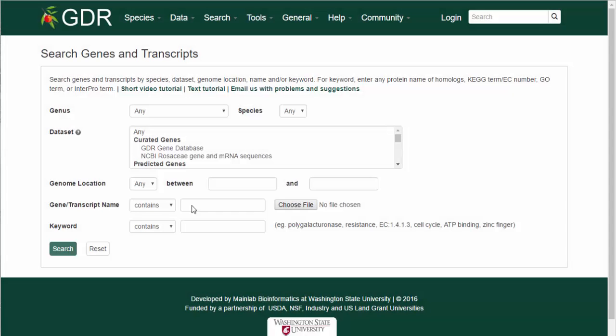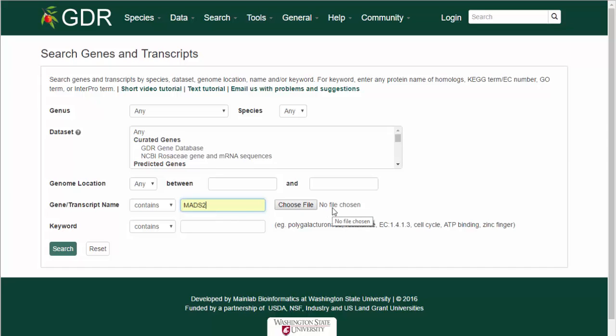You can also search for a specific gene or transcript name, or upload a text file of multiple gene and transcript names, and search for all the genes at once.